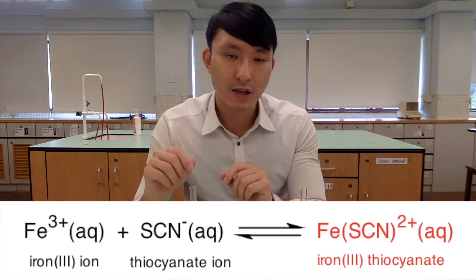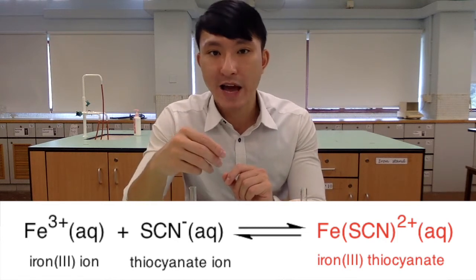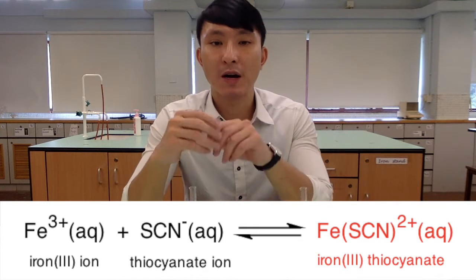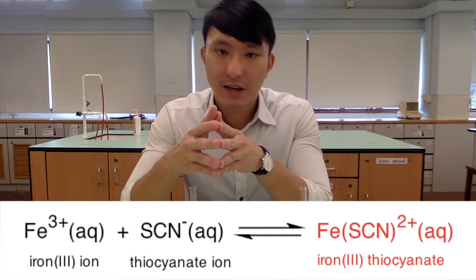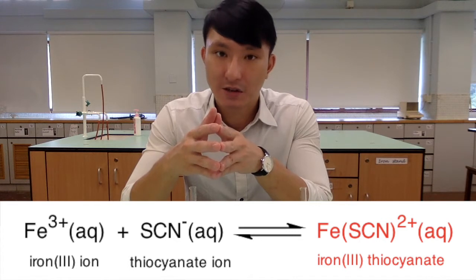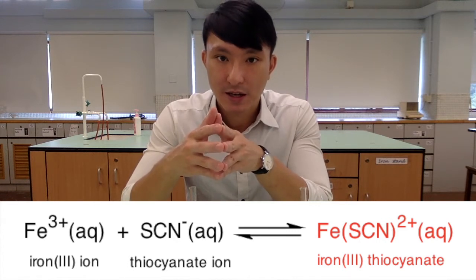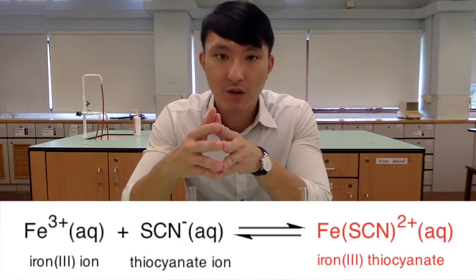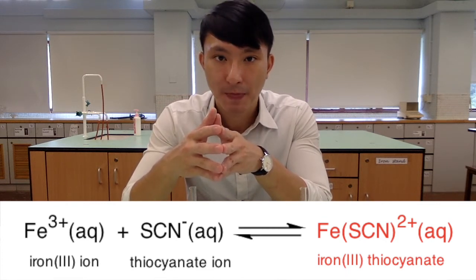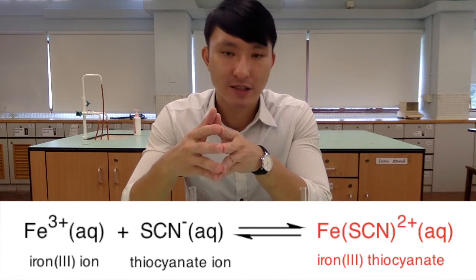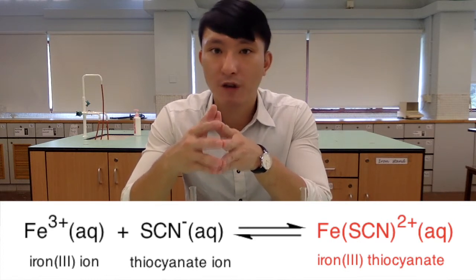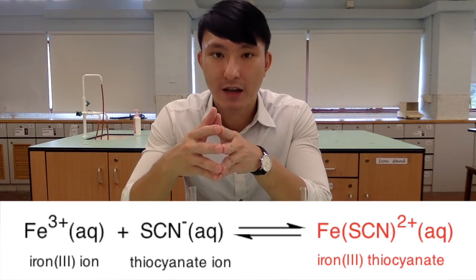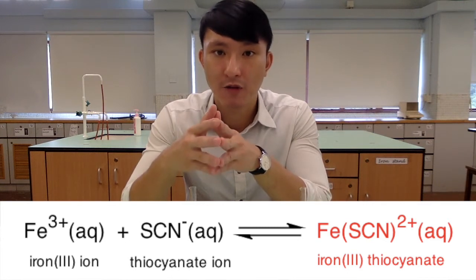As you can see from the reaction, IN3 ion reacts with thiocyanate ion to form a complex ion. In this reversible reaction, we are particularly interested in looking at the colors of the chemical species. First of all, IN3 ion should have a pale yellow to pale brown color. For thiocyanate ion, it doesn't have any color, so it is colorless. And for the product, it actually carries a very intensive blood red color.